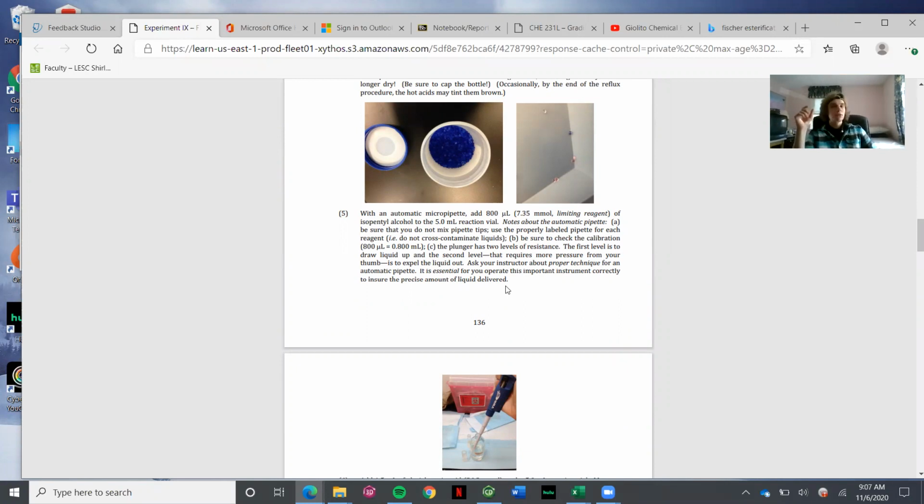You guys are going to take your blue silica beads. So these blue silica beads are a dehydrating agent. They just keep the reaction dry, because if water is able to get into the reaction, it will screw it up and it won't work properly. Because we know that water and acid come together to form pretty strong reagents that react with pi electrons and any reactive functional group, really, to form different things. And carboxylic acids and alcohols are very reactive functional groups. So we don't want water in the reaction.